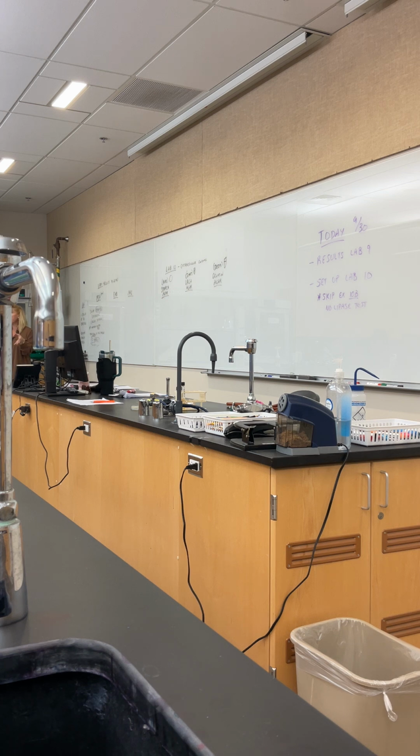So this allows me to tell a difference between the two species. If I have a pathogen of staph, it will turn yellow. If I have a non-pathogenic strain, it will stay white, which means my background stays pink. Everybody with me on that? Okay, so that's what's making it differential. But we also have another component. So I'll put the one here for the differential.